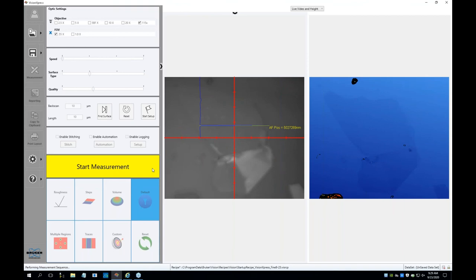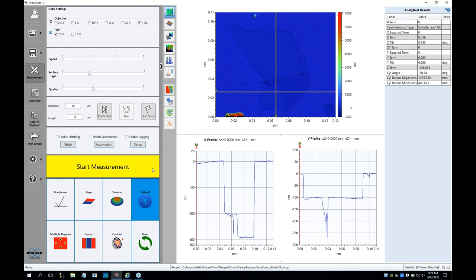Almost all the presentations I saw used vertical scanning interferometry or this combined mode, which is now called universal scanning interferometry on our side. During my presentations, I mentioned that for the waveguide, I was instead using pure phase shifting. This was the sole case where phase shifting was in use.